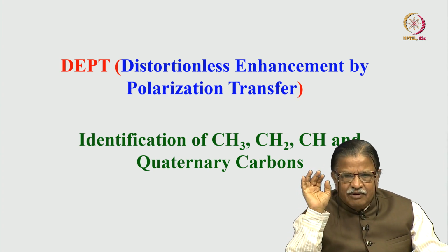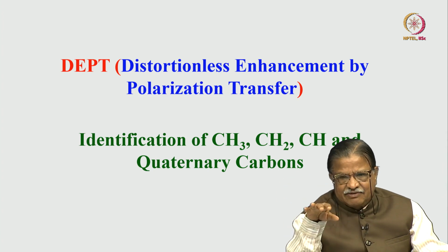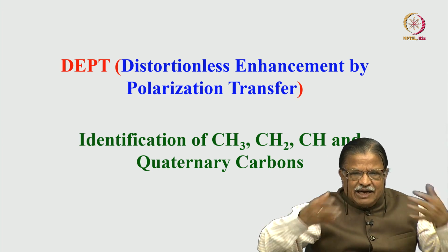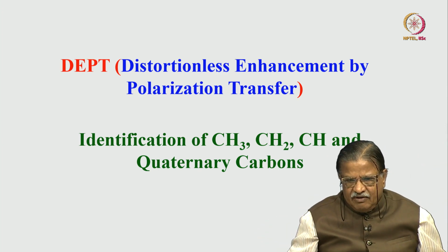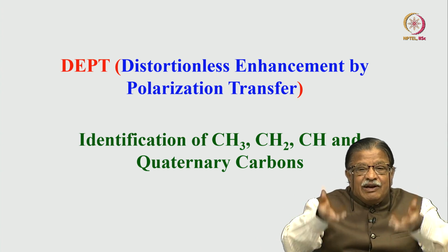But right now understanding of that is not important, but please remember there will be a polarization transfer, which means we will transfer the polarization or the magnetization from abundant spins to rare spins. When we do that, what will happen? The dilute spins intensity will go up.